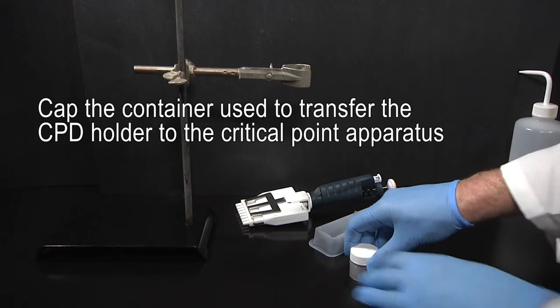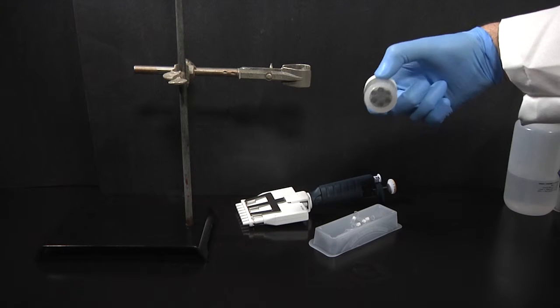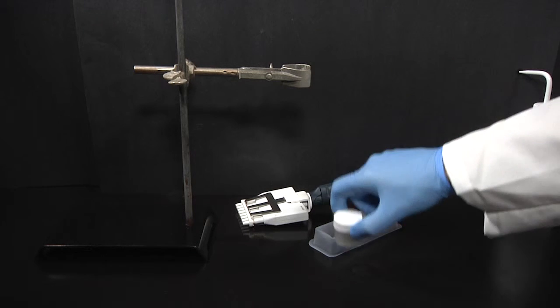The container for the CPD holder is covered to enable safe transfer to the critical point apparatus without spilling. Shake to remove any bubbles from around the samples.